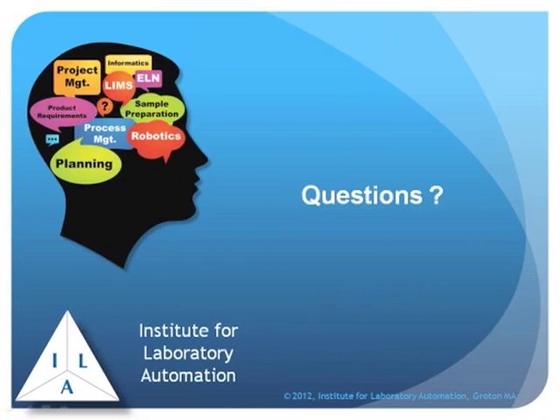Hi, Joe. Yep, we've had a few questions that have come in. One of them is, can you give an example of where instrument settings can adversely affect lab data? Yeah, I'm going to use chromatography only because it's an instrument that I'm really familiar with, and it's also probably one of the most popular instruments that exists out there.